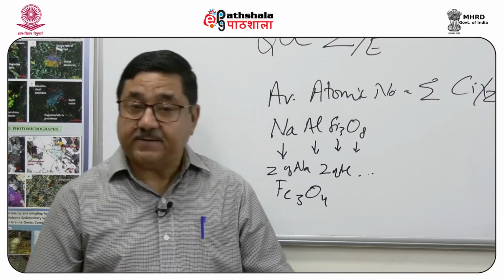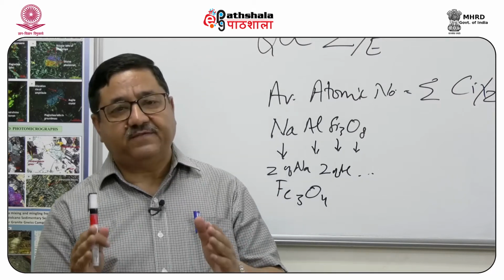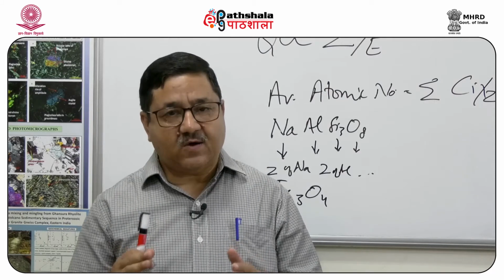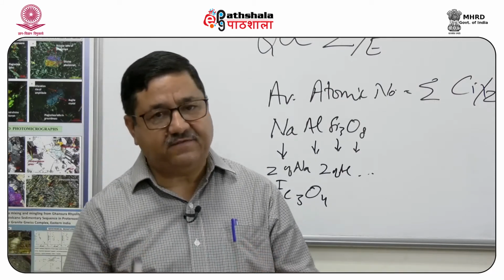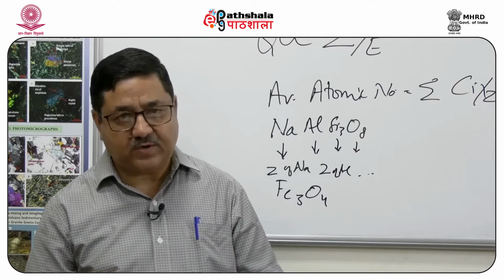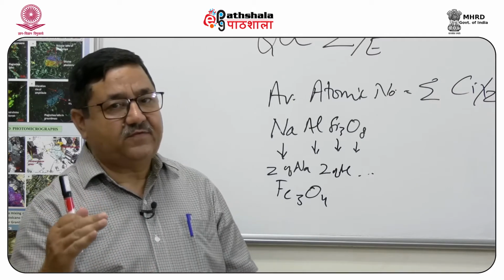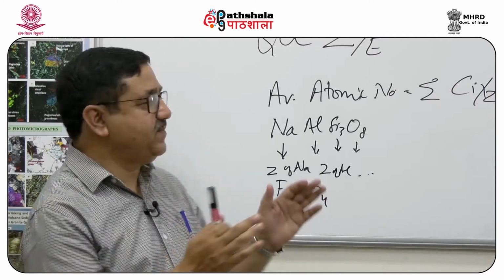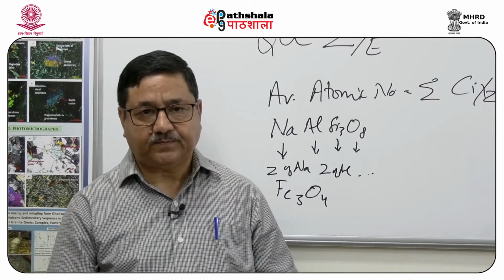So, this function allows us not only to distinguish different phases of different composition, but also to distinguish variation of composition within a phase, and one can pick up zoning in this. At the extreme end of this, even 0.1 atomic number differences can be picked up by a scanning electron microscope.